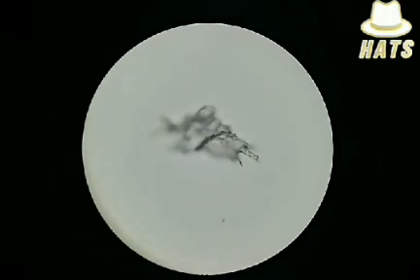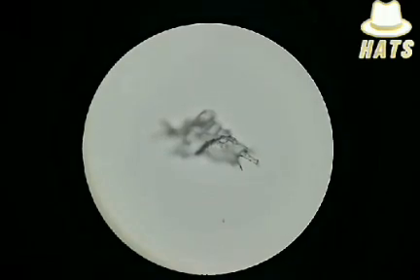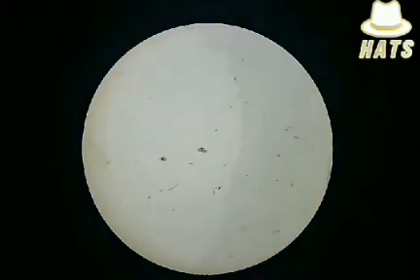You can see how it's splayed into layers. Okay, I'll reduce the size again to 400x, then I will go back to 40x magnification.